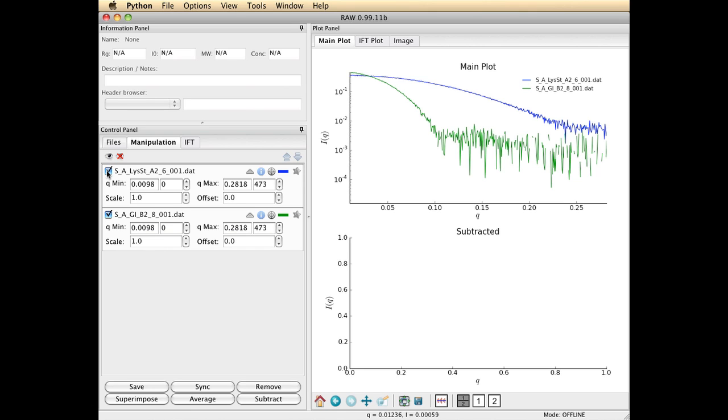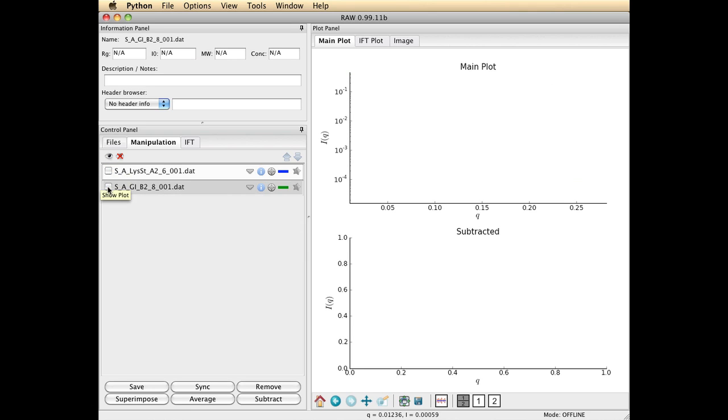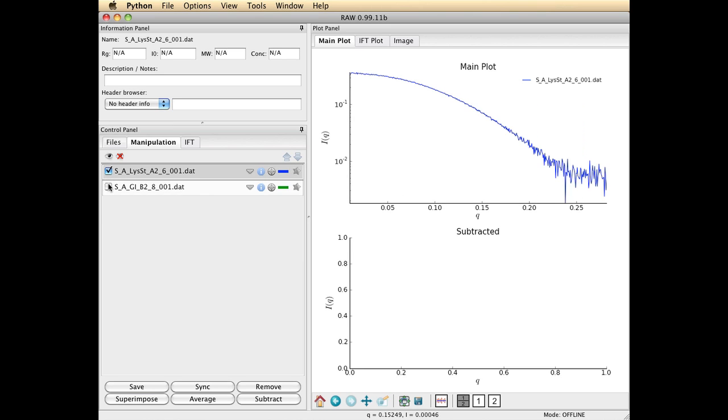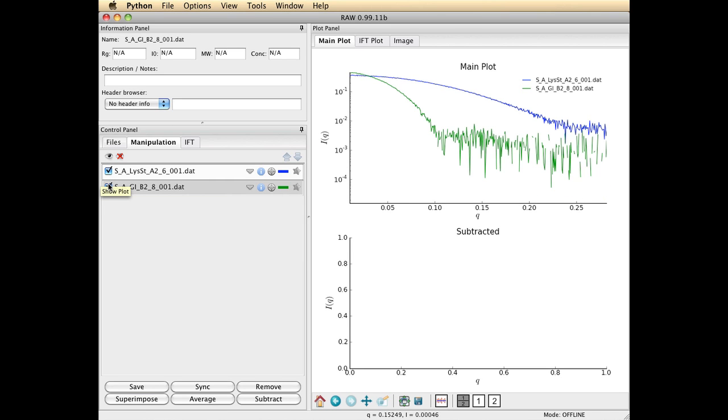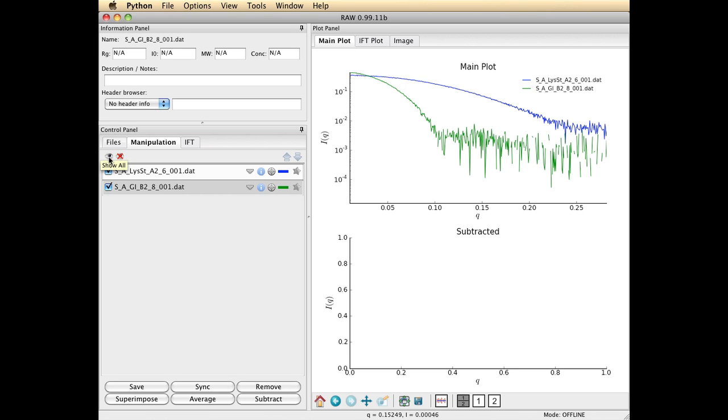A little check tells you whether or not it's displayed. So I can uncheck and you'll see that my plots have disappeared. Or I can check them and have them reappear. There is an eye icon and a crossed out eye at the top, which allows you to hide everything or show everything all at once.